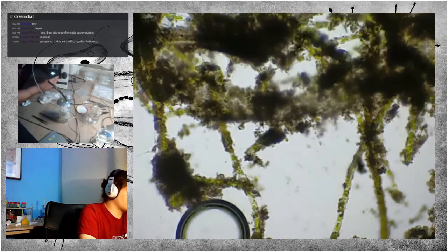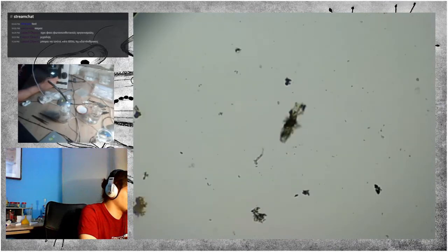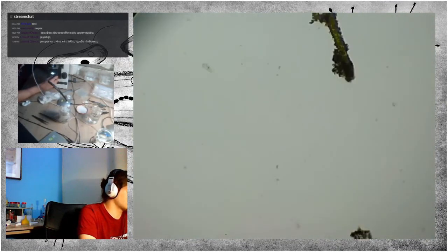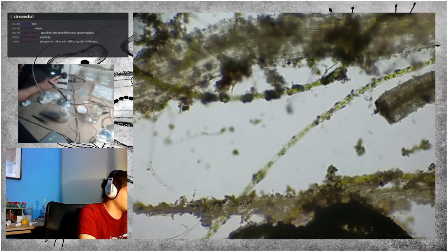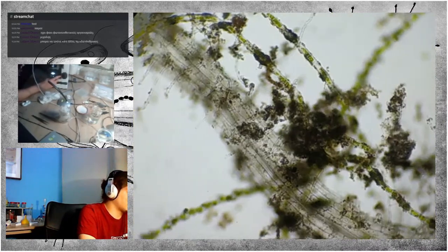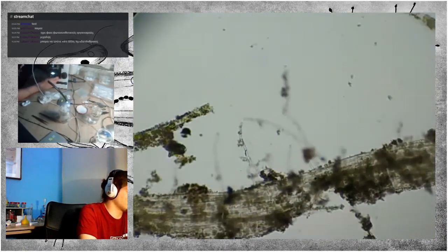But otherwise, in terms of ciliates or other microorganisms, it is very hard to judge because obviously you cannot see them before you put them under the microscope, except if they are very large, like stentors, which you can obviously see if you have gotten any.